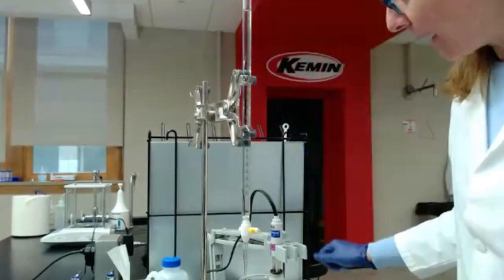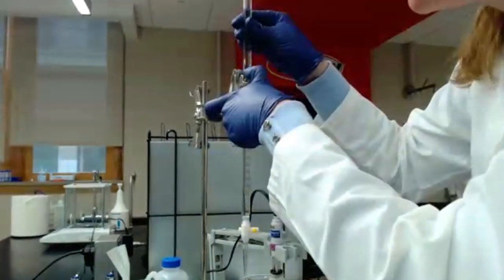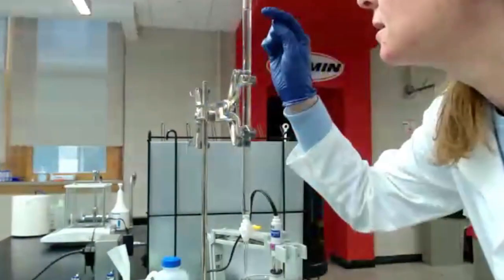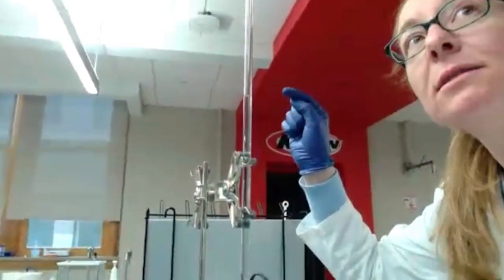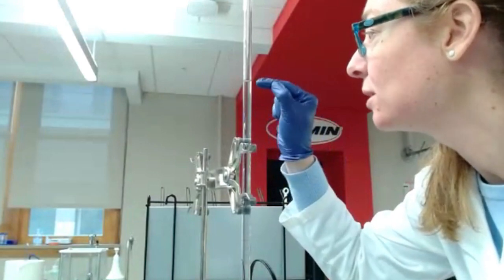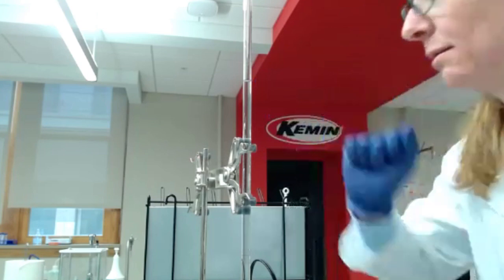Here, I make sure the graduation is easy to look at, and I look at the same level. My eyes are right in front of the line. I'm looking at the bottom of the meniscus, and I have 24.1.